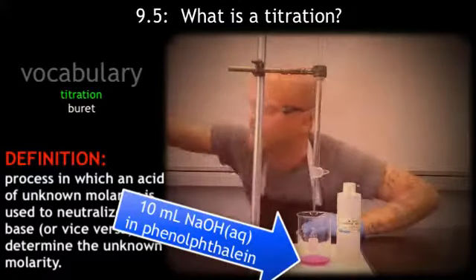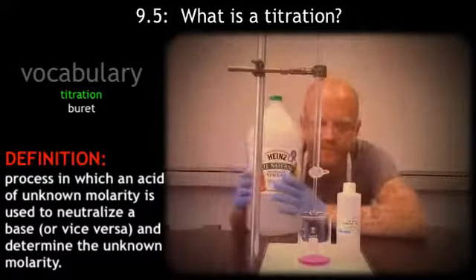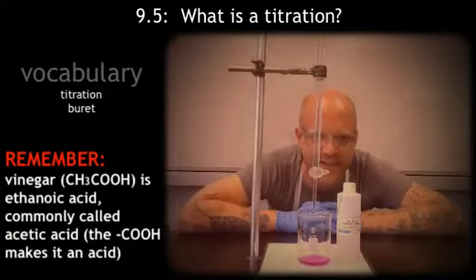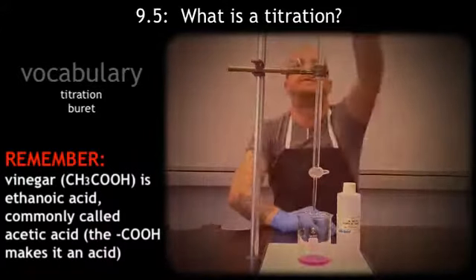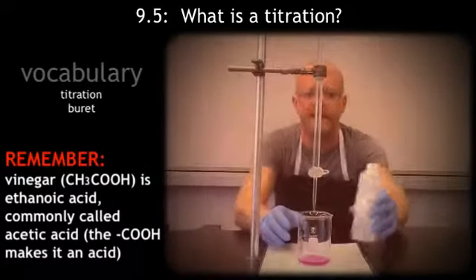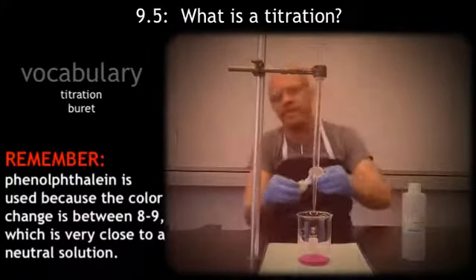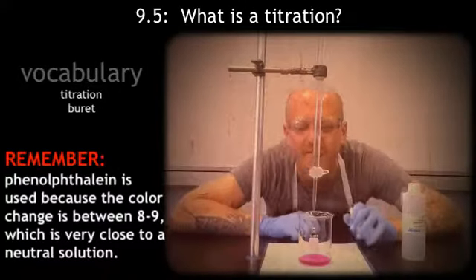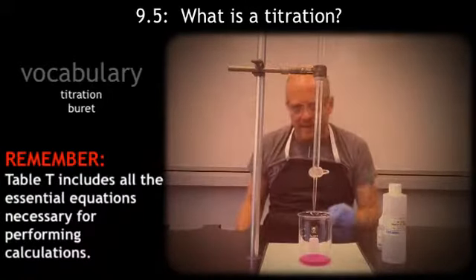And I'm going to do a titration to try to figure out my molarity, or the concentration of vinegar. A titration is when you take an Arrhenius acid and an Arrhenius base and you do a neutralization. So I'm going to see exactly how much vinegar it took to neutralize this. I used some phenolphthalein in here, which is the stuff that makes it purple. You see it has a strong pink, dark fuchsia pink color. When I said purple, I meant pink.